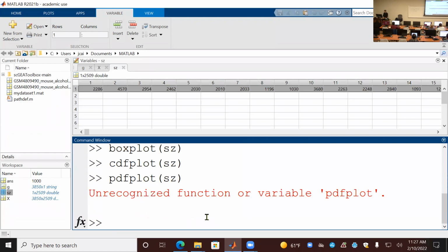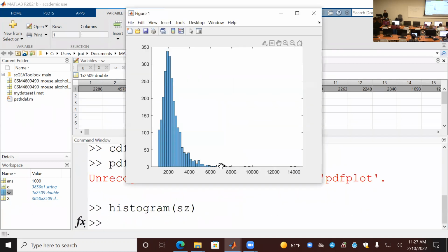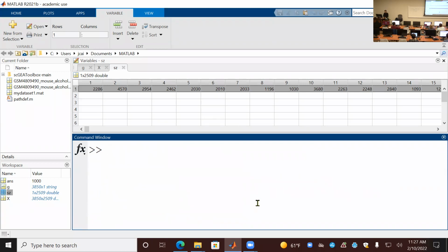So we have a cutoff of 7,000, and we want to get rid of the cells with more than 7,000. What should we do? I'm doing an operation to compare each element of the library size to 7,000, to see whether it's greater than that.